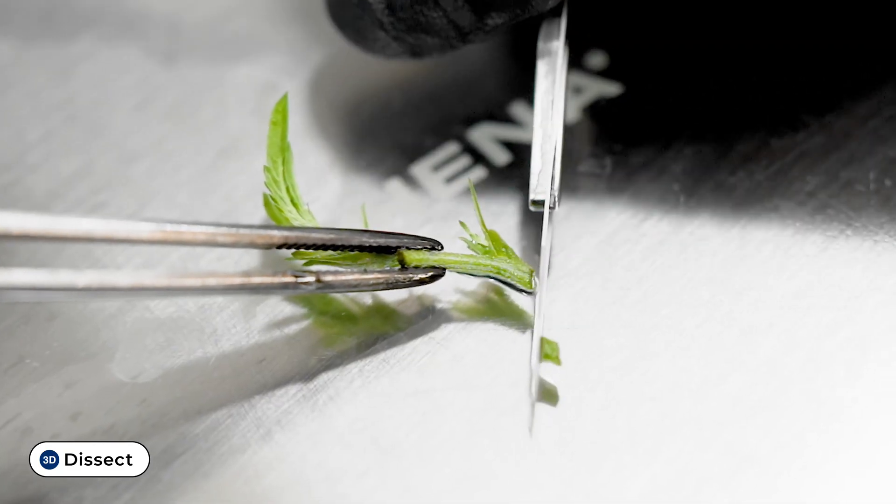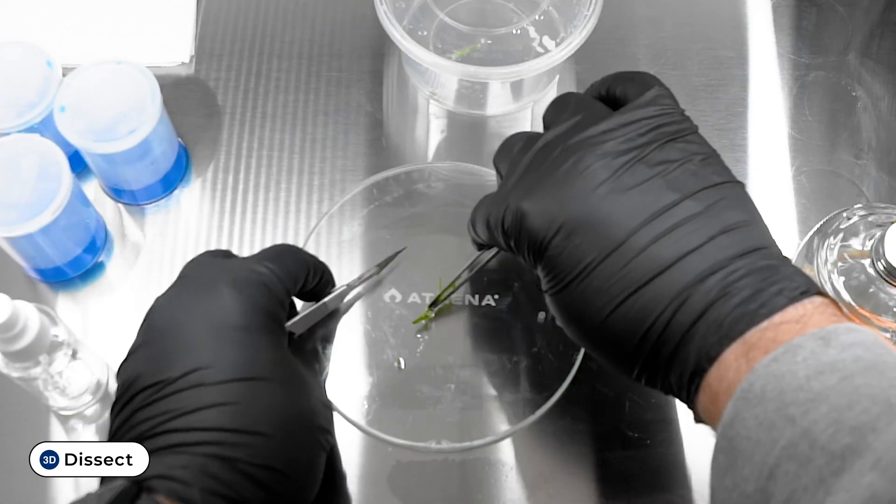While holding the node steady with forceps, dissect it at the lower end, leaving enough stem to go into the gel.